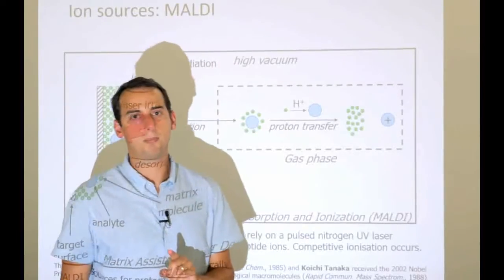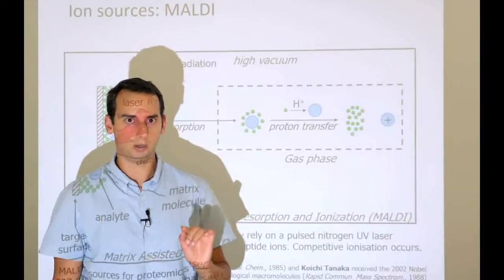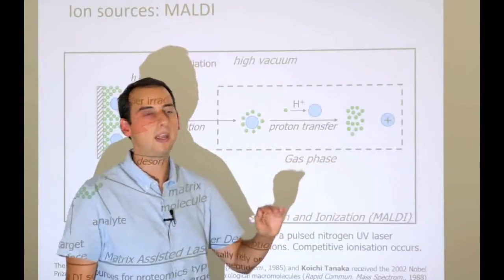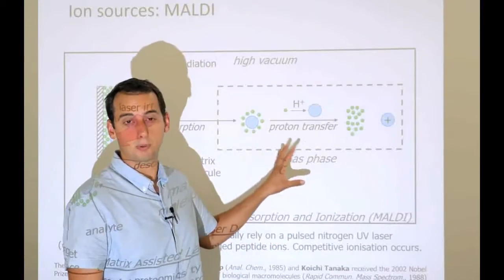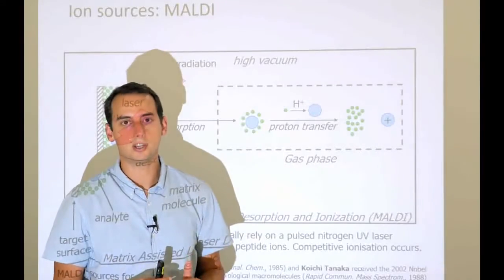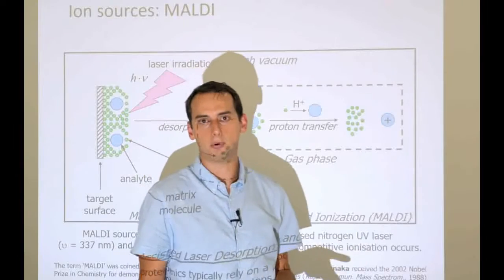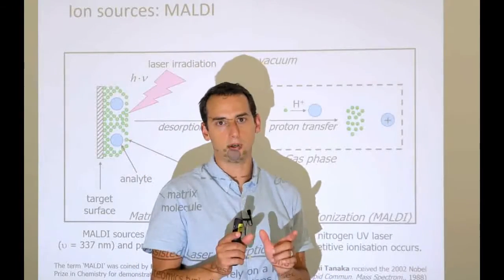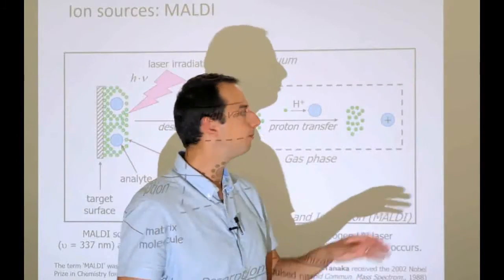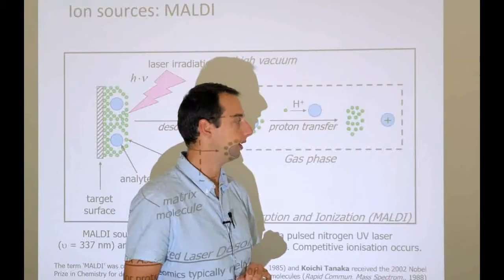Very important in MALDI is that the charge for peptides, at least, tends to be one and only one. So a peptide gets a single positive charge, nothing more. If you were to study intact proteins, however, they are much bigger and can accommodate many more charges. So a protein in MALDI can have, and will likely have, more than one charge. But smaller molecules like peptides, which tend to be around 10 amino acids long on average, will have only a single charge. This becomes important later on.